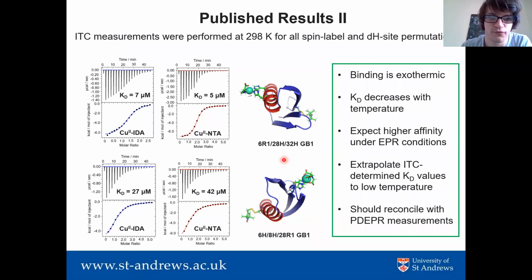What we found, and something we were eager to look into in more detail, was the composition of the matrix. I suspect this would be something you could modulate if your binding affinity was not very good, even at a given temperature.